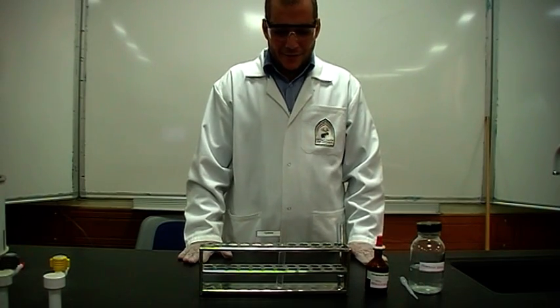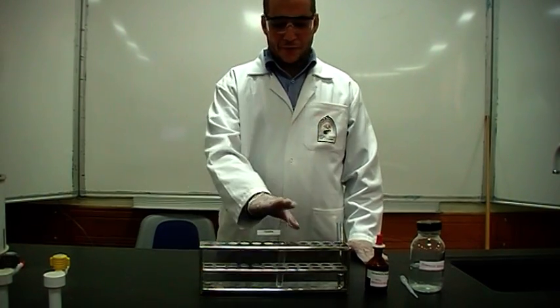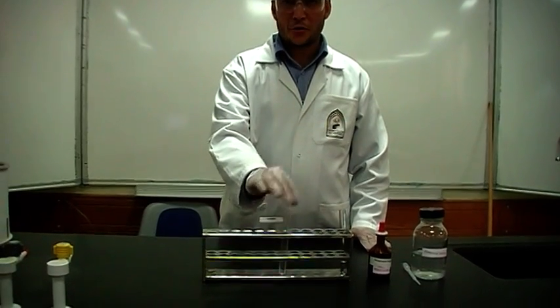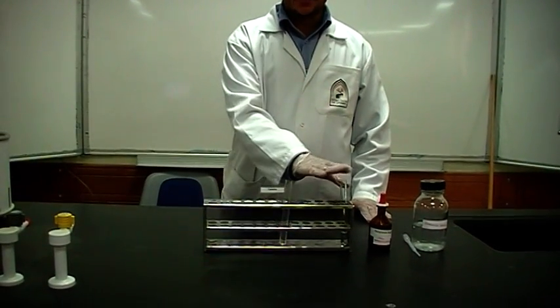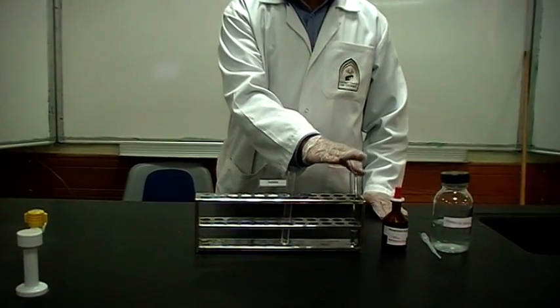Let's do the nitroprusside test. Simply, we have cysteine, amino acid or protein containing cysteine, and you have a control that doesn't contain any cysteine.